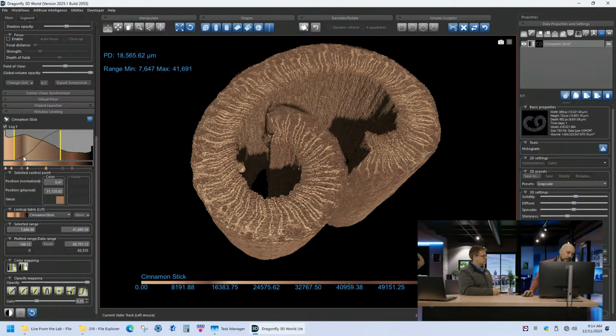Right? So now on the left side of that curve, the left side is a little lower, and the right side goes up a little more. So it's going to retain the higher density a little better than the lower density. Yeah. If you had a lot of air scatter and didn't have something like this, the air scatter would be blocking everything. Right. So it just helps.